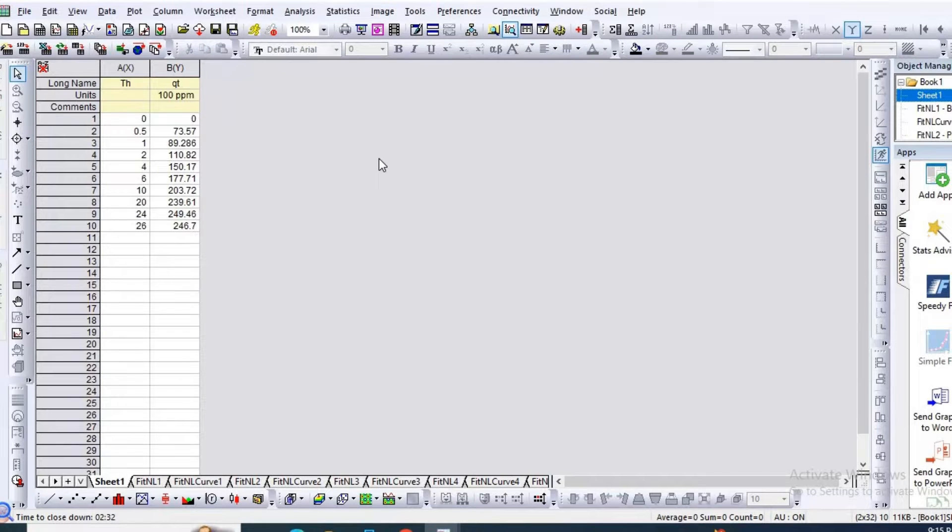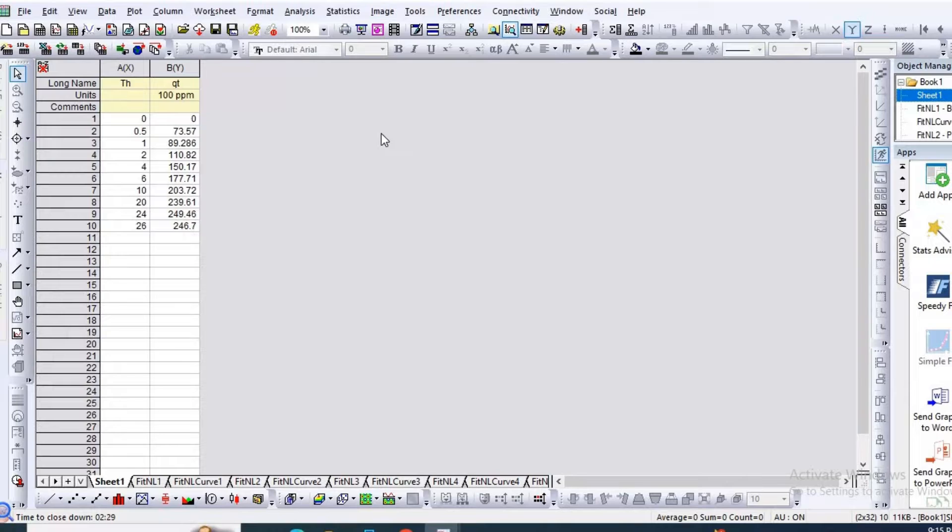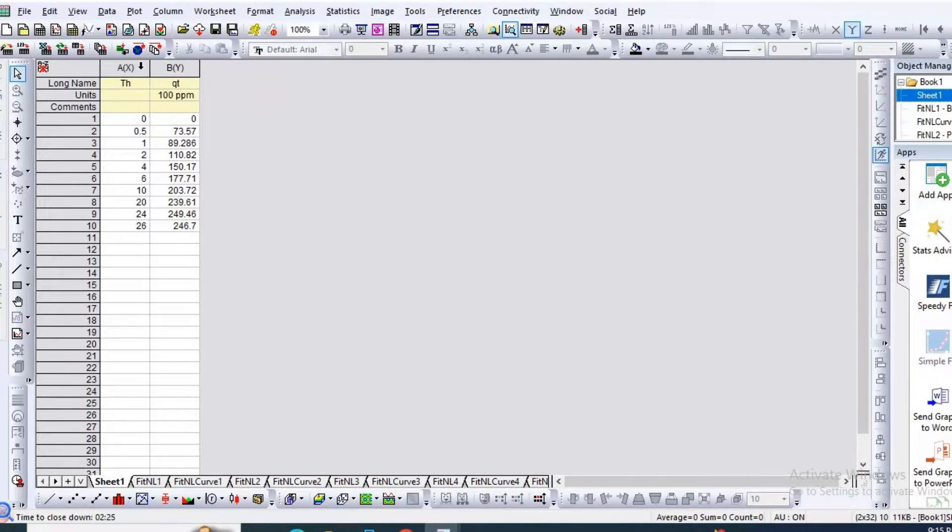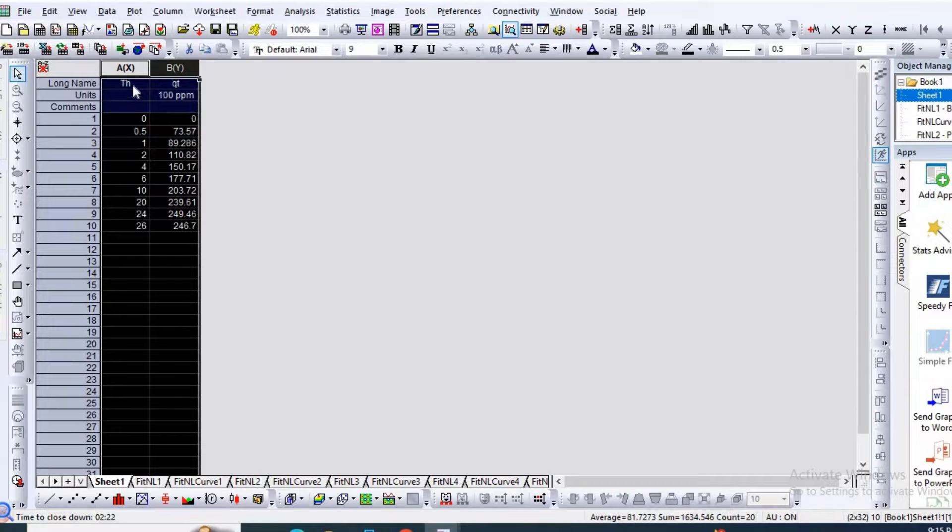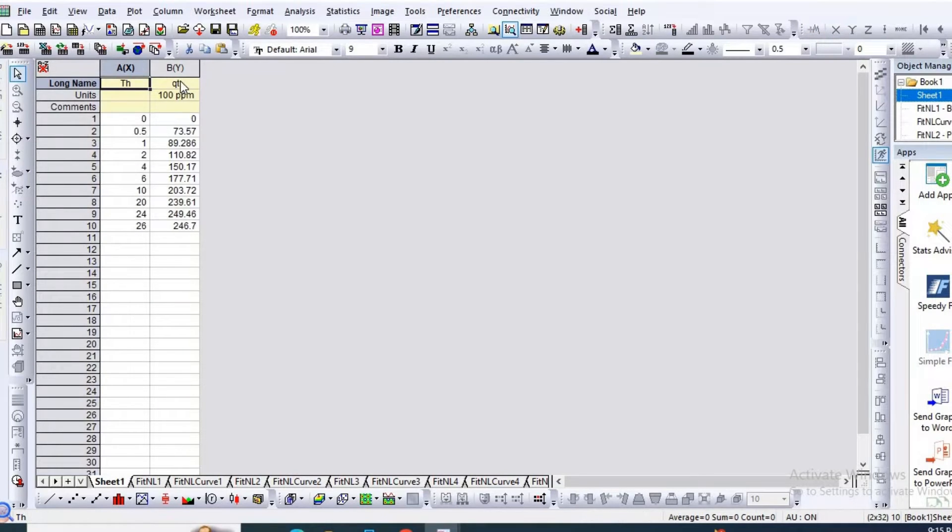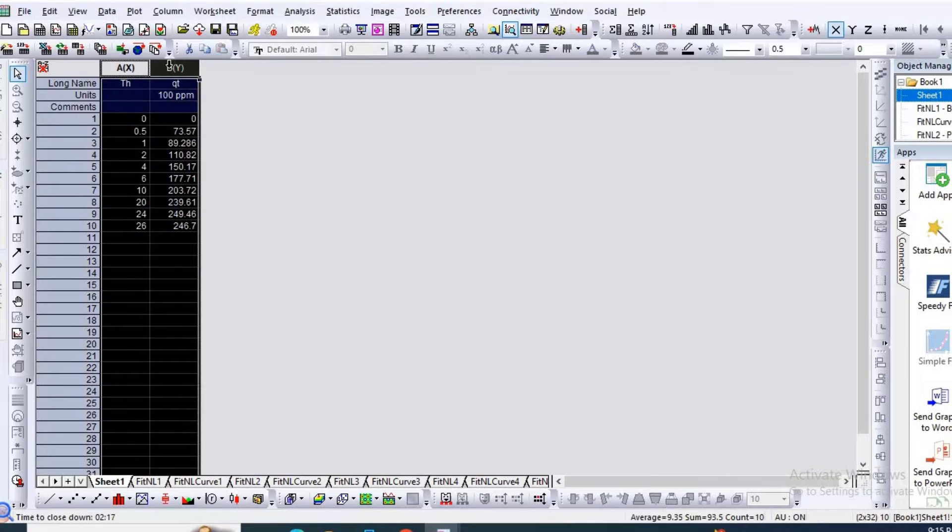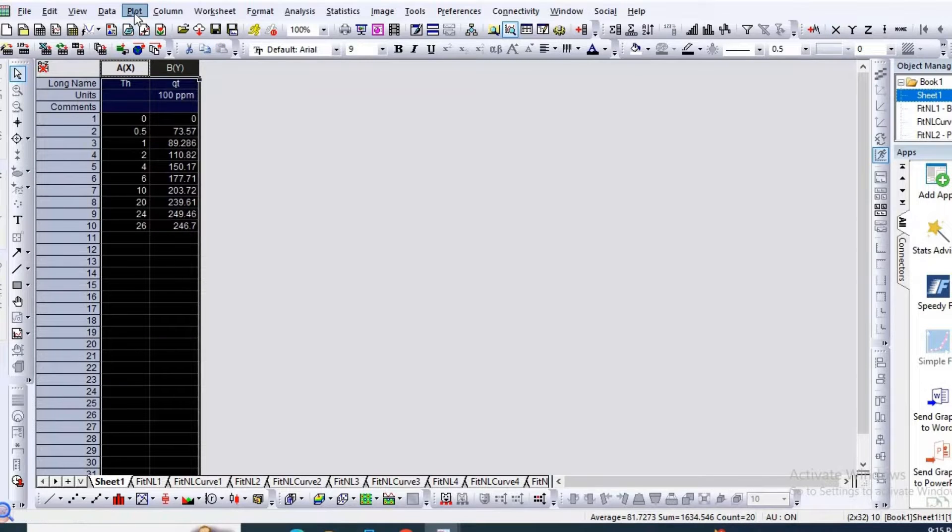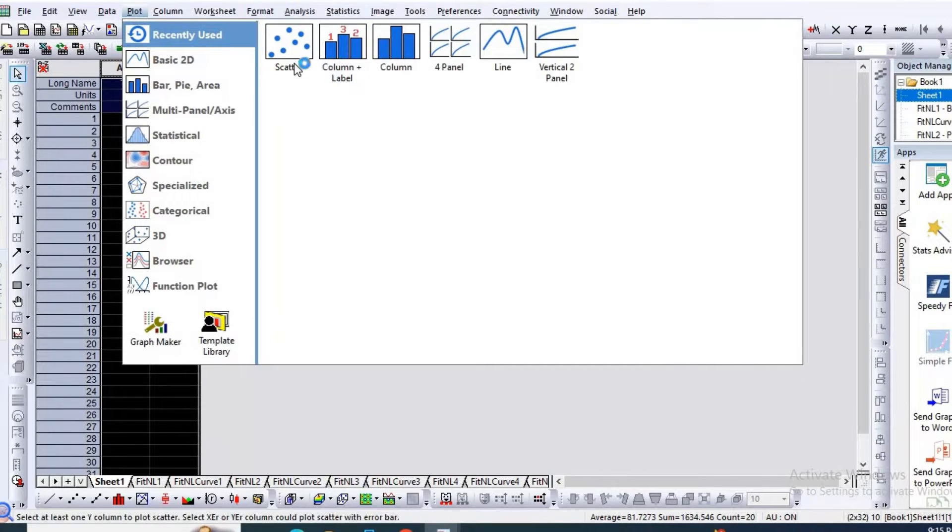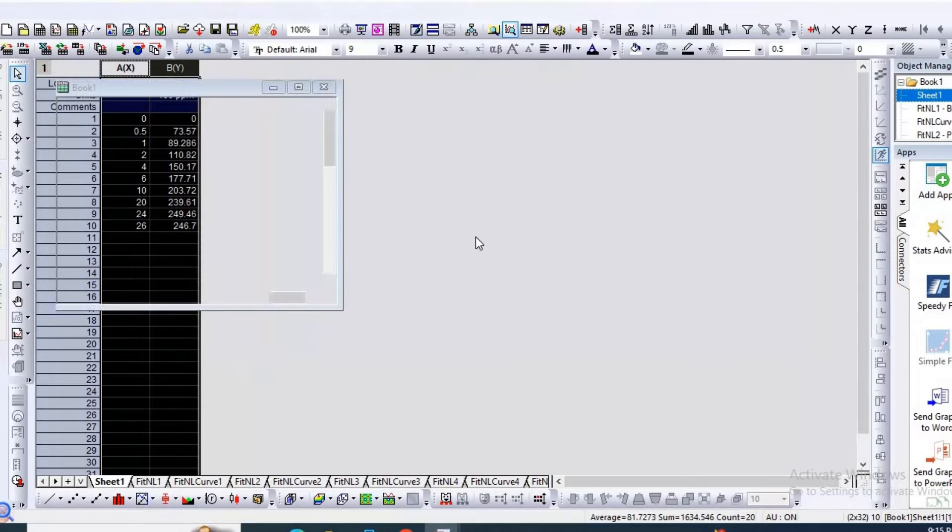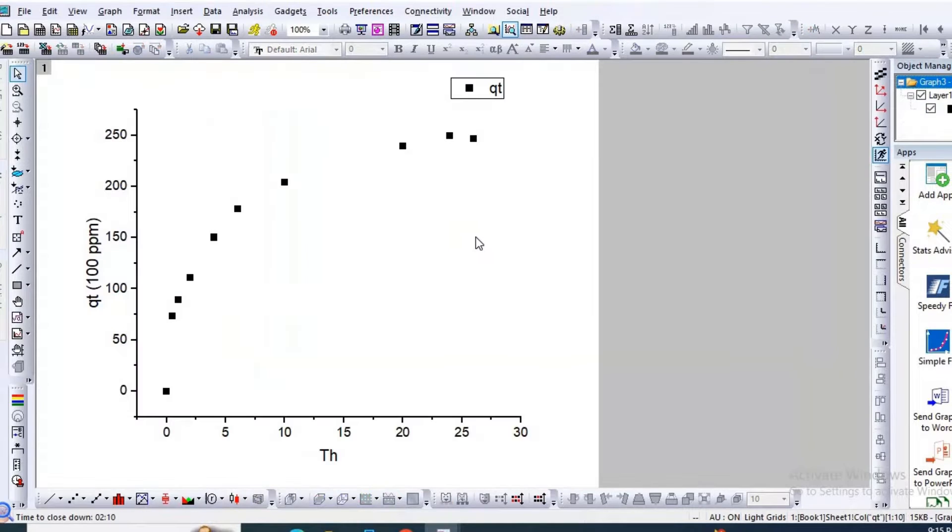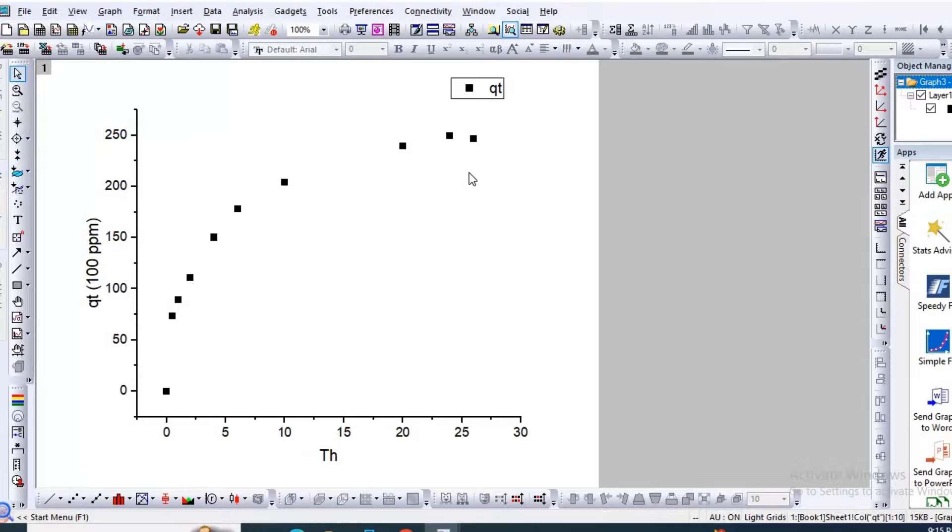In order to fit four isotherm model data, I have taken adsorption kinetic data for time as well as amount adsorbed units. Now let us plot the scatter. So here is your kinetic plot.